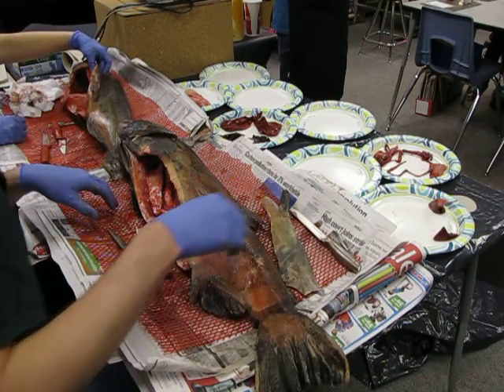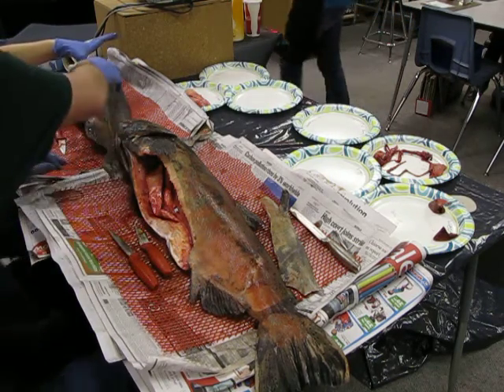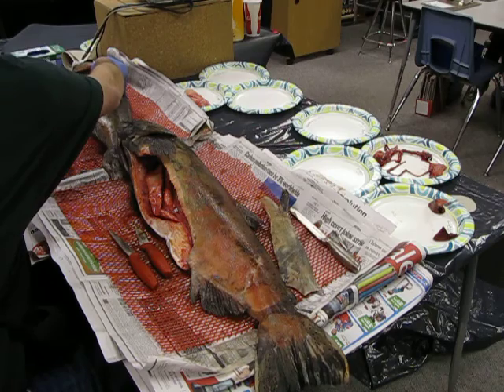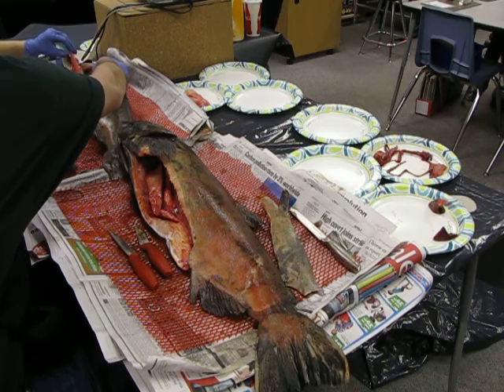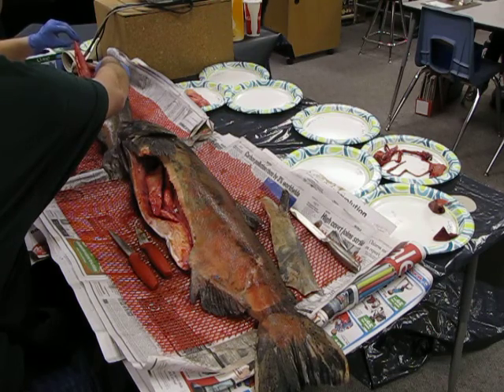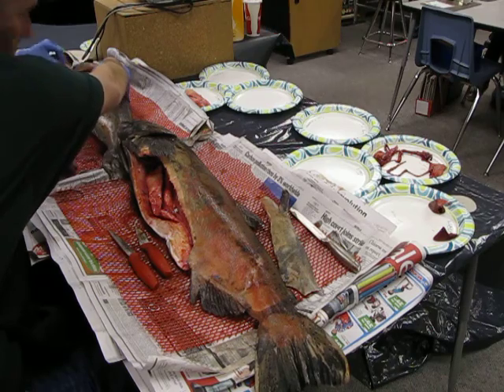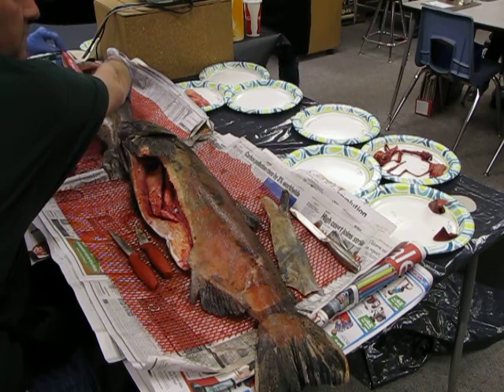Could you take the liver and put it under the duck? Absolutely. Just set it under. They are perfect. Liver and spleen. And this is from both of our fish there. So do you understand that, children? They don't have 2 livers and 2 spleens. We need 2 fish. Understand?